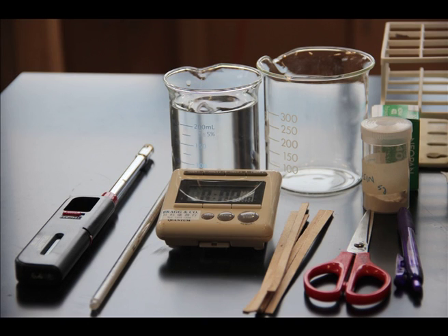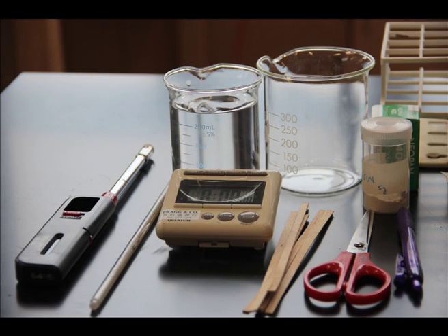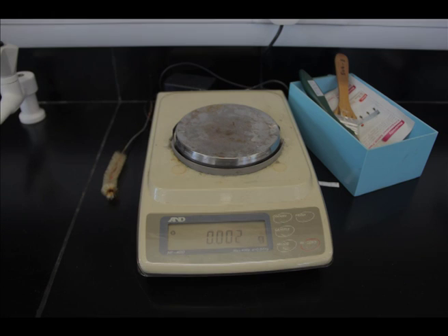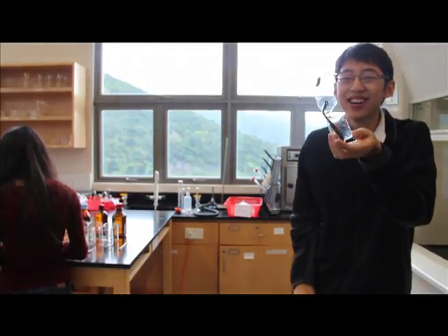The equipment is 5 grams of trypsin, 35 millimeter photographic film, which is gelatin coated and cut into strips, 18 100 milliliter beakers, 1 500 milliliter beaker, 1 100 milliliter graduated cylinder, 2 10 milliliter pipettes, 1 thermometer, timer, distilled water, scissors, marker pen, tape for labels, Bunsen burner for hot water, lighter, balance, stirring rod, and tweezers. Make sure you put on your glasses and aprons for safety.